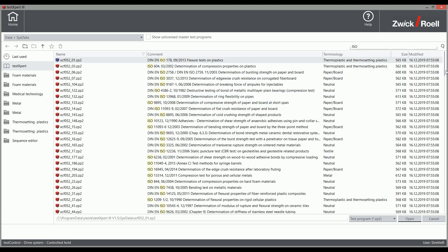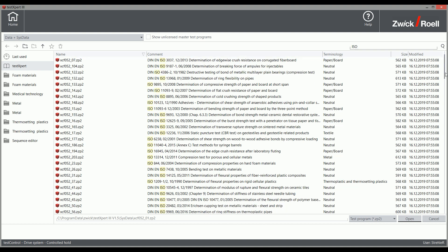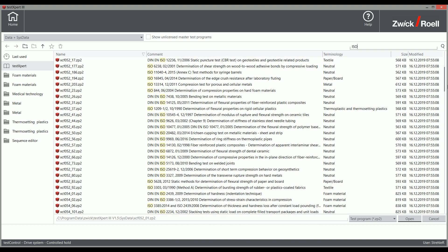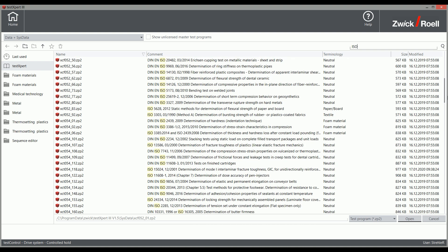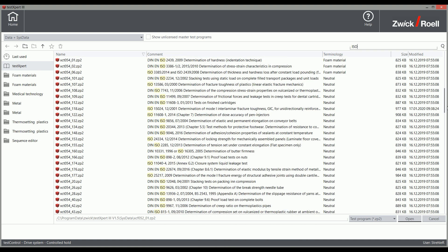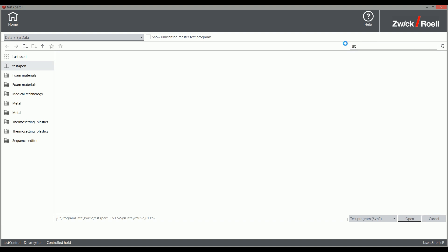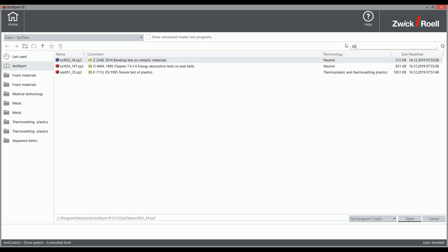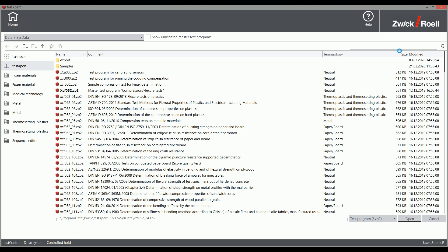For tests that go beyond the standard, or for the ability to freely configure the test sequence for tension, compression, flexure, tear growth, peel, adhesion, or cycle tests, TestExpert 3 offers prepared master test programs. Master test programs are explained in a separate video.